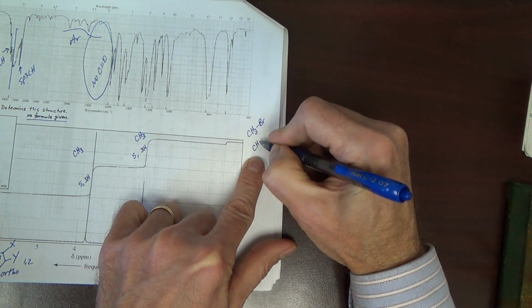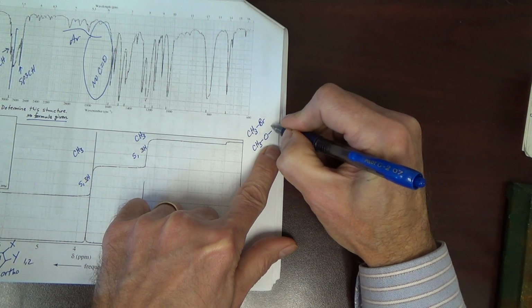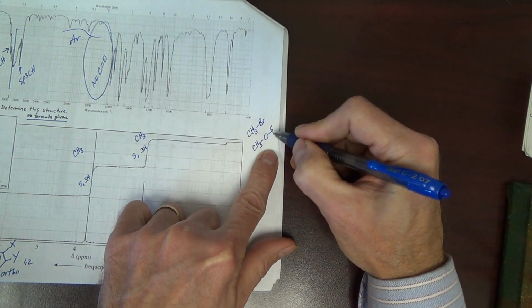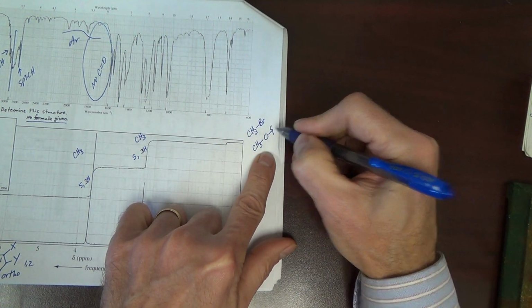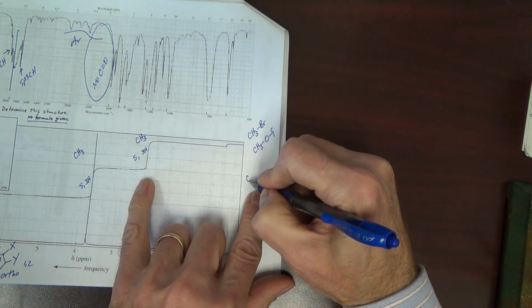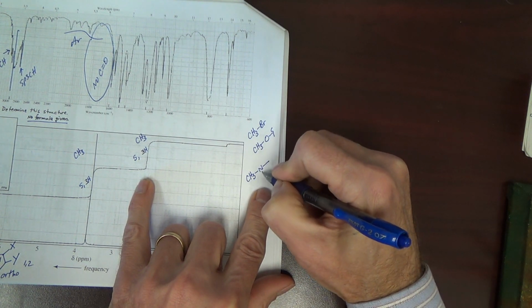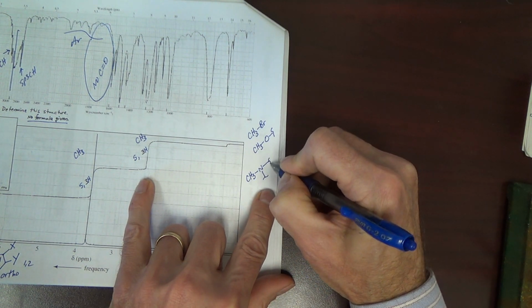If it's bonded to oxygen, this allows you another side to bond, because oxygen makes 2 bonds. Now, if it was bonded to nitrogen, you would have 2 additional places to bond.